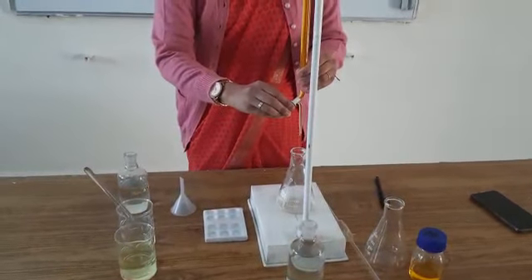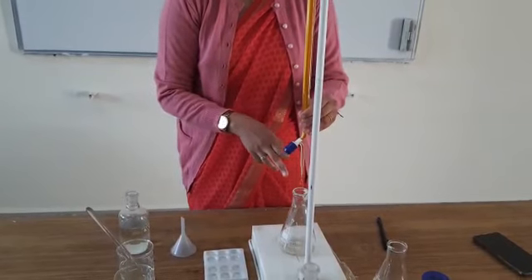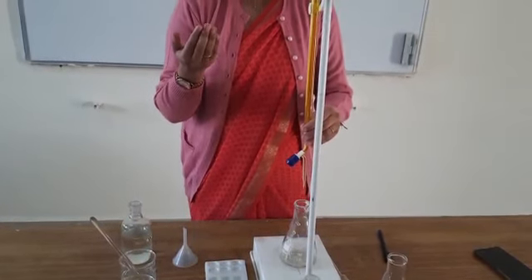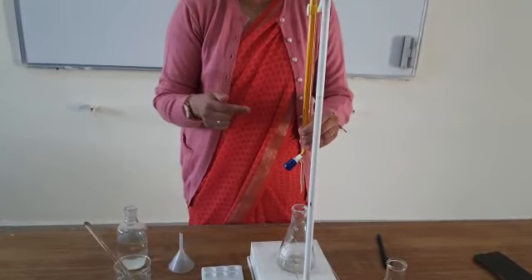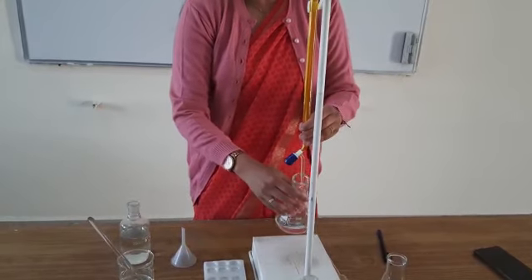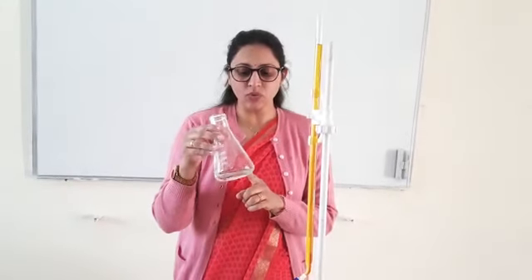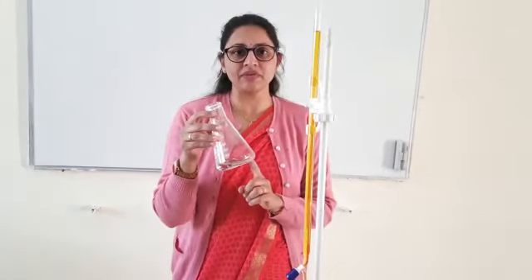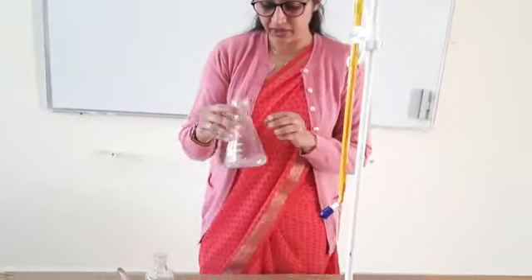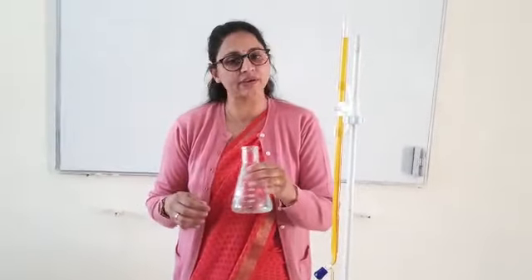We need to add the potassium dichromate drop by drop to the ferrous ammonium sulfate. After adding every 1 ml of solution, I will add the external indicator to check. Let us mix the reaction mixture. The dichromate will oxidize the ferrous ammonium sulfate into ferric ions. Let us check the presence of ferric ions in the solution with the help of the external indicator.